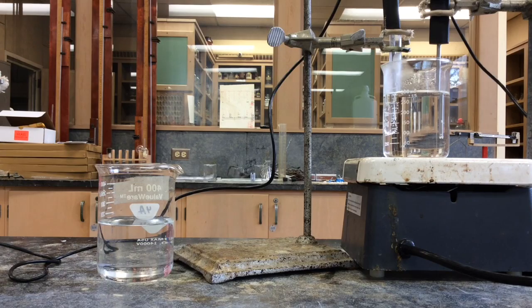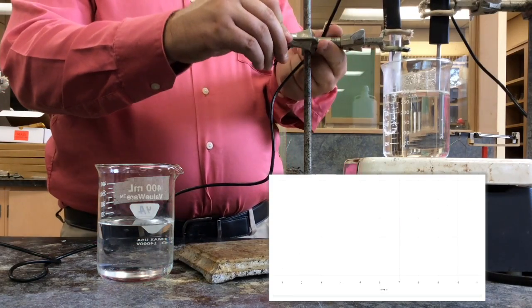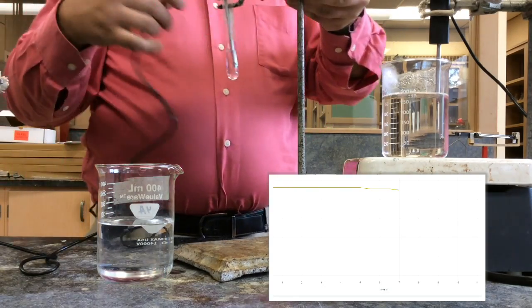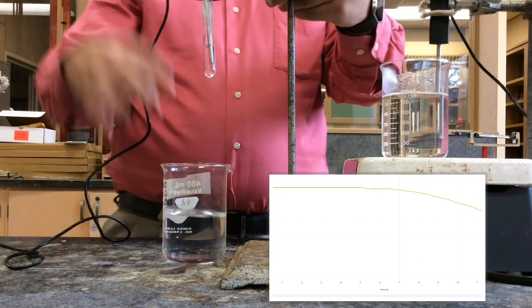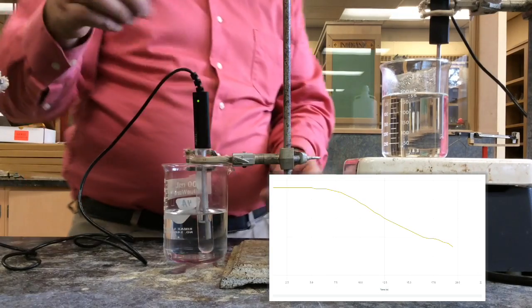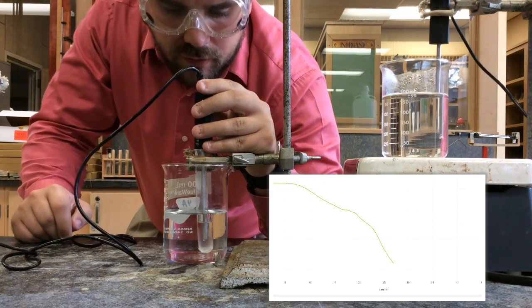And so I'm going to click record. And then I'm going to click collect. And we are collecting data. So I'm just going to take this guy out like so. I'm going to fling this guy around here. Now the important thing about the cooling curve is I don't want the temperature probe touching the side of the glass. But right now it is, but when I submerge it I'm going to have to hold it to where it is going to stay pretty much even, not touching the side of the glass or anything like that. So I'm just going to hold it like that, and now it's just a matter of waiting.